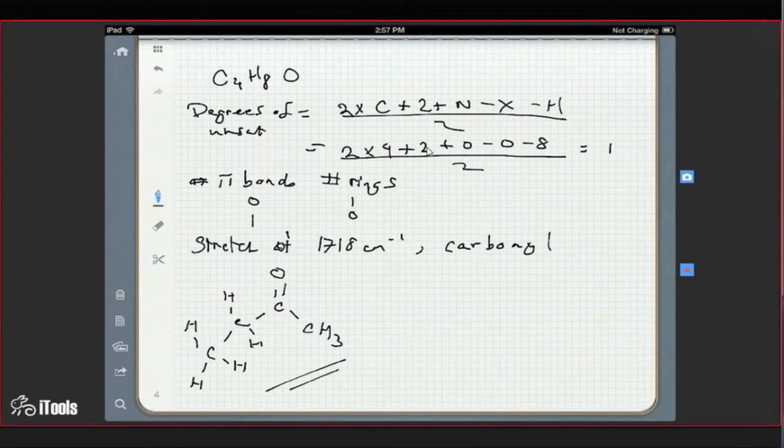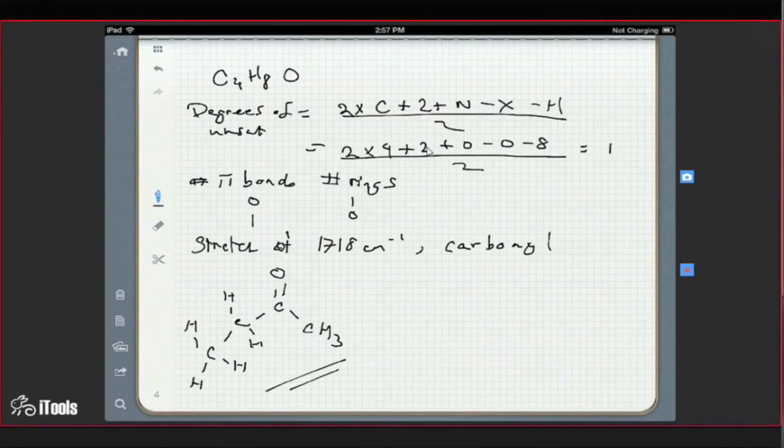Okay, excellent. That was a very good, expeditious way to work through that. Just one thing to add there. So you saw there was an oxygen. How did you know it was a carbonyl? From IR. The IR was pretty clear because there was a 1700 peak. So once you saw that it was a carbonyl, what possible functional groups could it be?